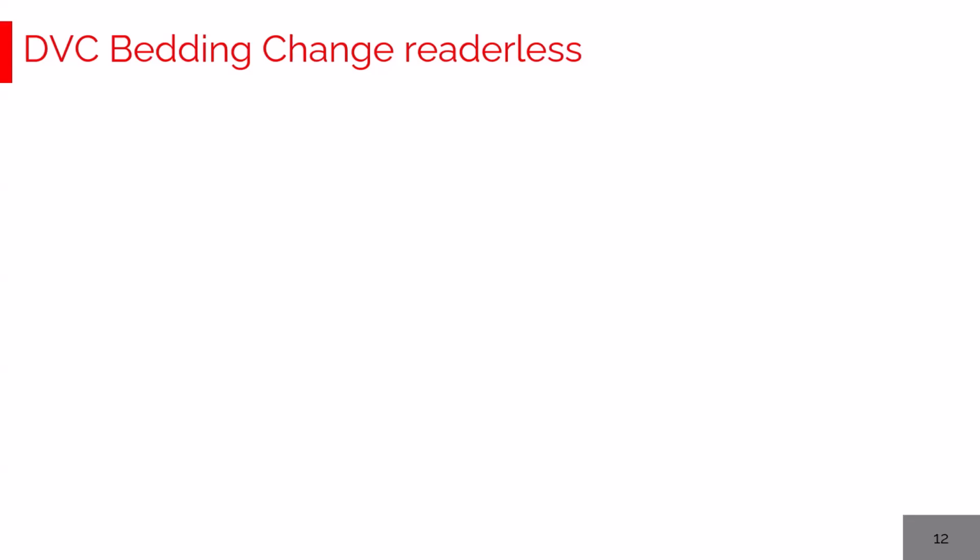There is another scheduled task called bedding change, and recently we also introduced a preferred, better, simpler and more straightforward way to perform it. We call it internally readerless, because as you can see in a few seconds from the video, there are no readers anymore over the working surface.